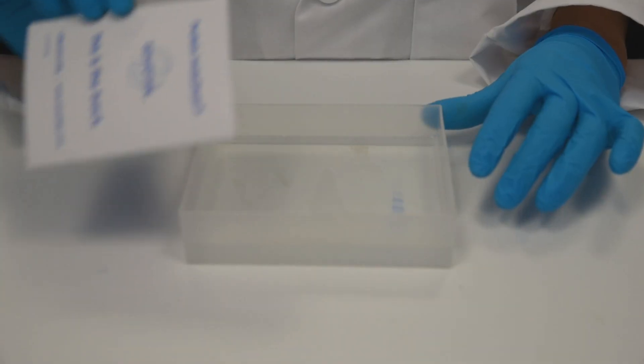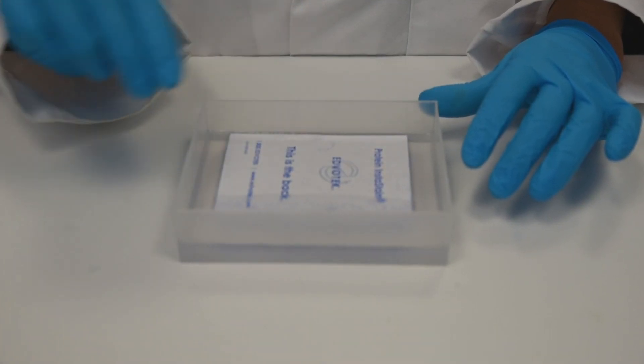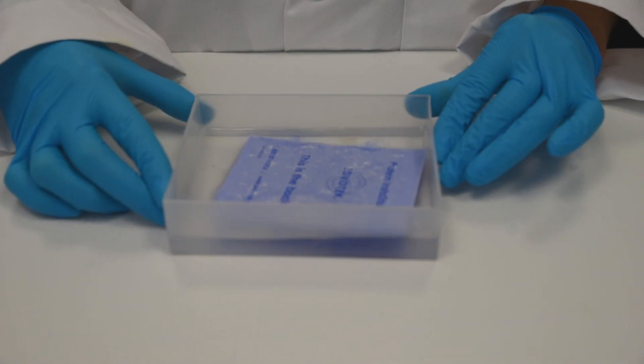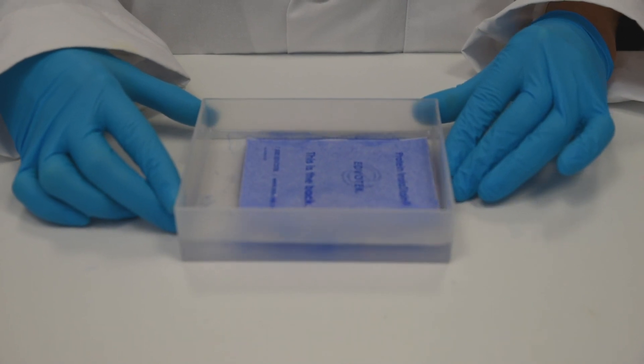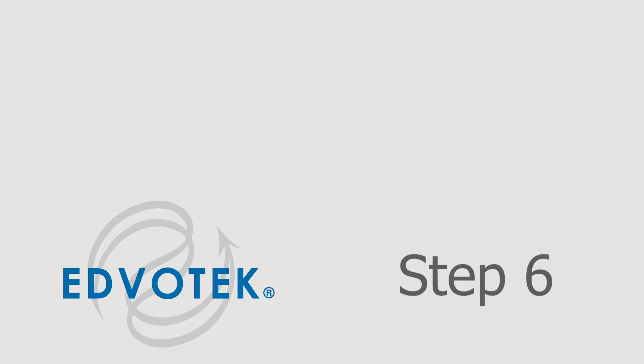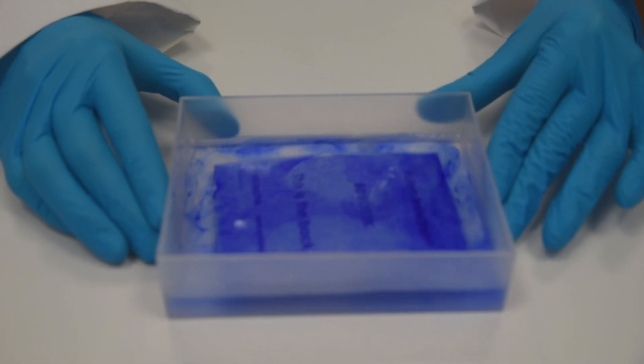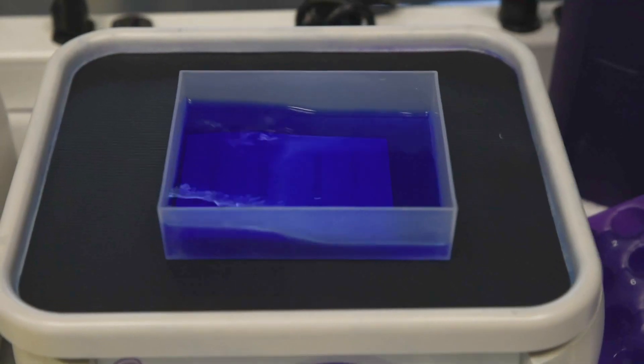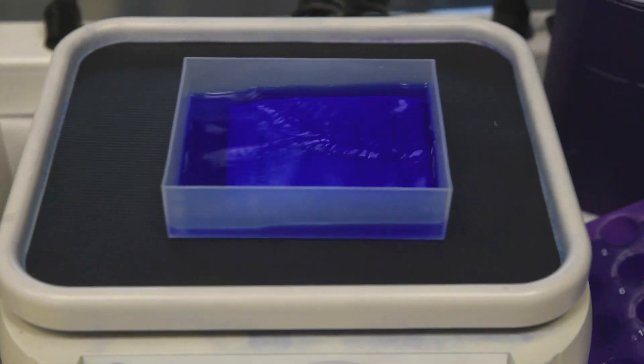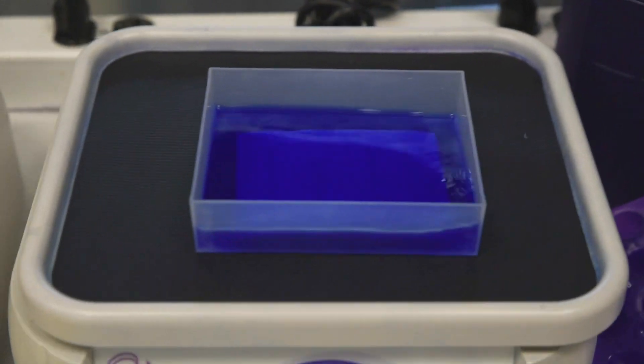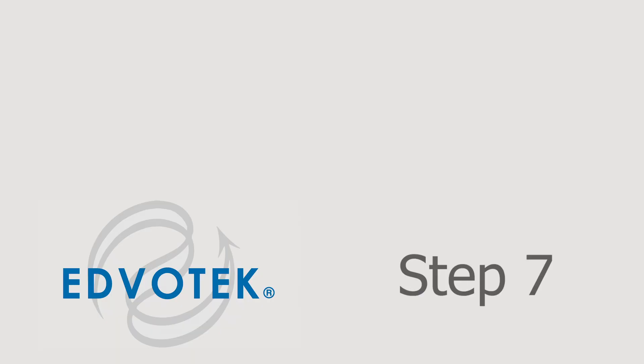Step 5: Gently float a sheet of protein instastain with the stain side down in the staining-destaining solution. Step 6: Allow the protein instastain paper to stain the gel for about 1 hour at room temperature with gentle, occasional, or continuous agitation.